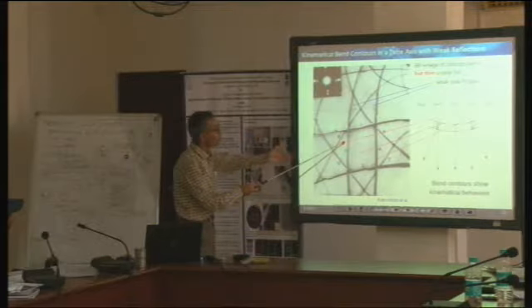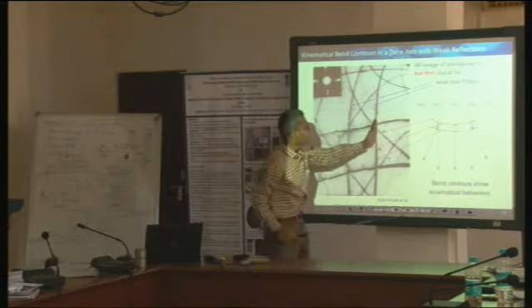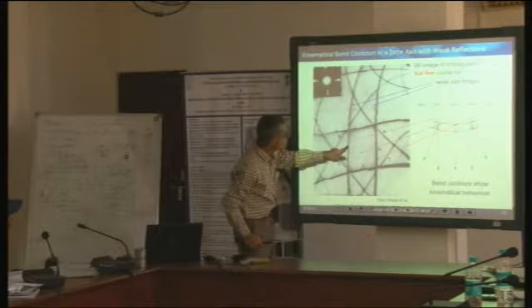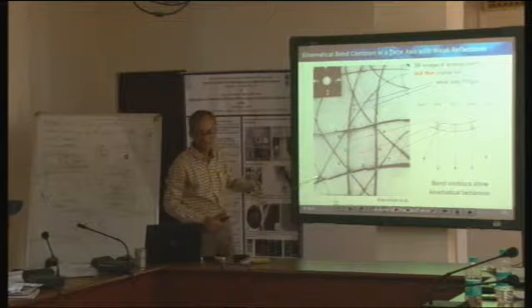Then this is a bend contour which corresponds to another reflection, with its own side fringe. So this was fairly easy to interpret and understand.